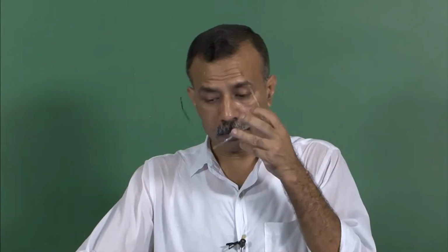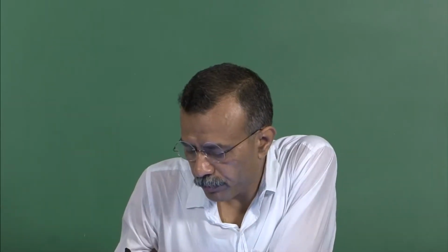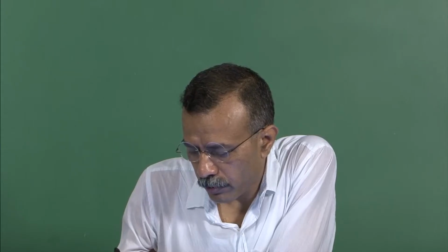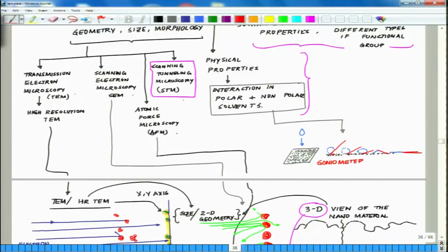This is done with an instrument called a goniometer, and this powerful technique is called contact angle measurements.